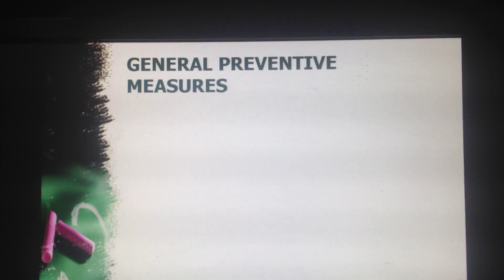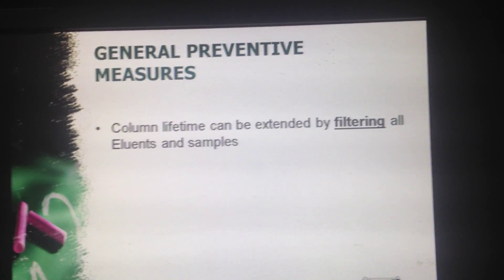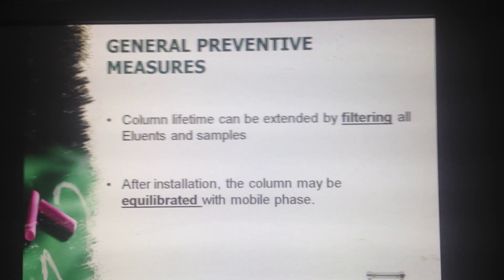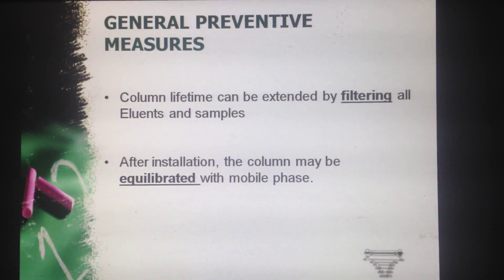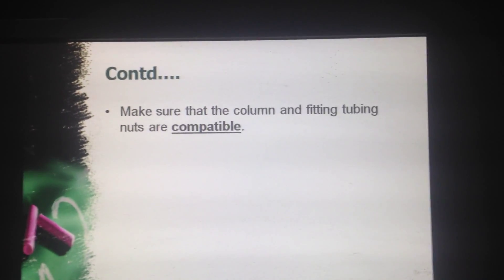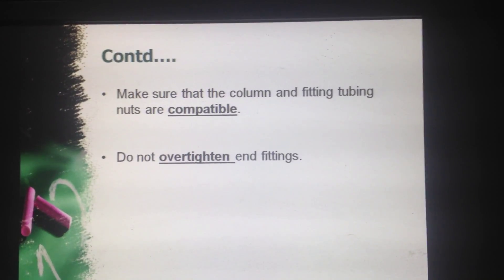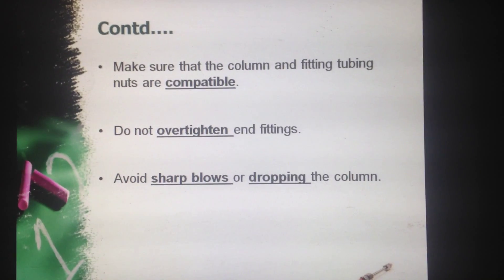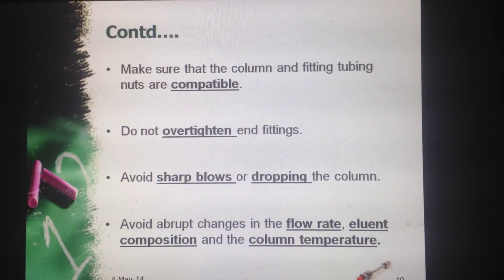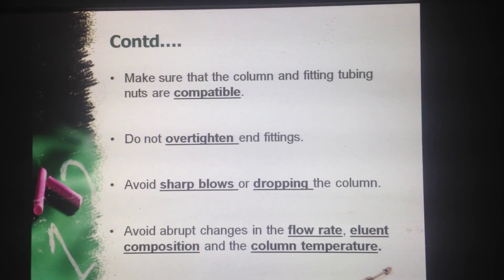Now what are the general preventive measures? First, column lifetime can be extended by filtering all eluents and samples. Second, after installation the column may be equilibrated with mobile phase. Third, make sure that the column and fitting tubing nuts are compatible. Fourth, do not over-tighten end fittings. Fifth, avoid sharp blows or dropping the column. Sixth, avoid abrupt changes in the flow rate, eluent composition, and column temperature.